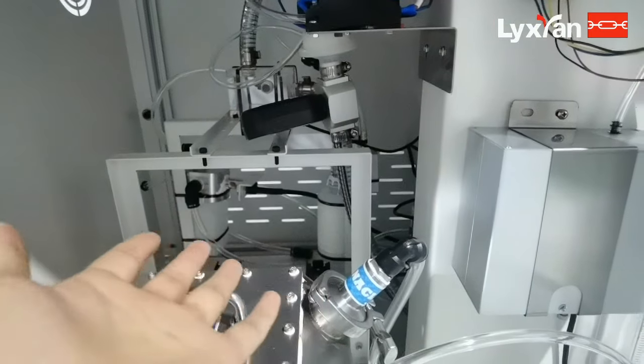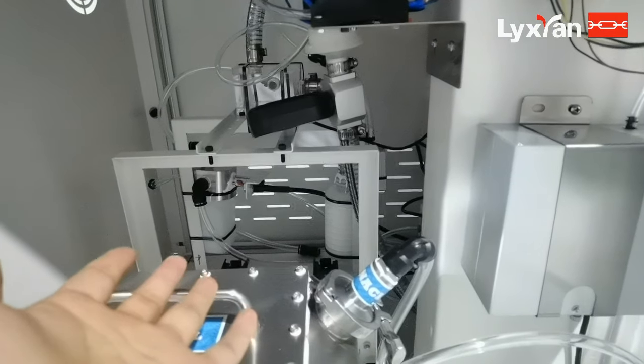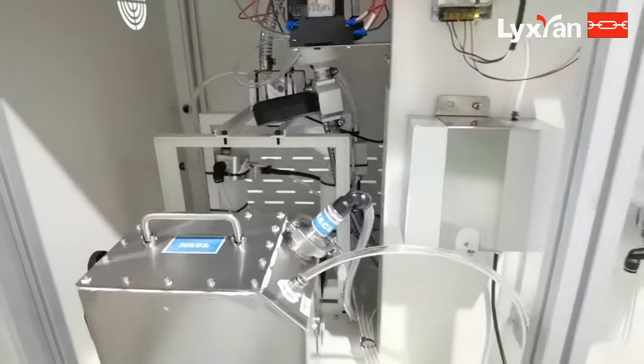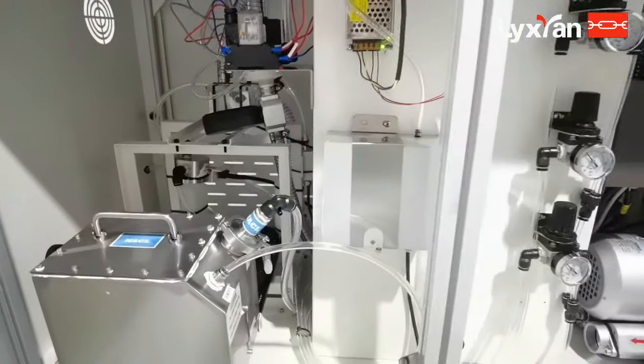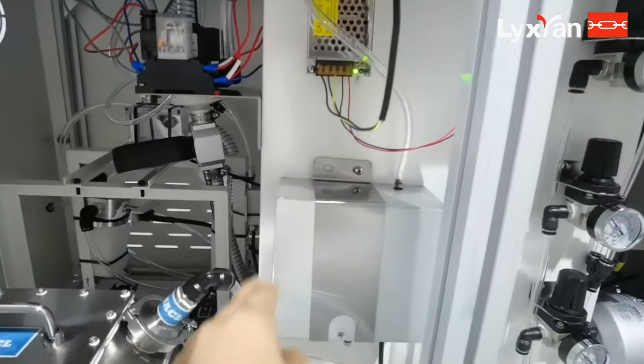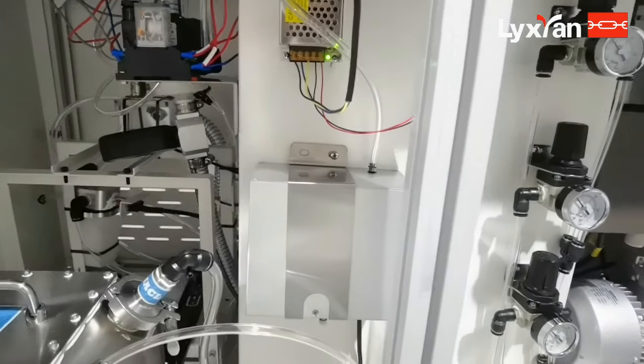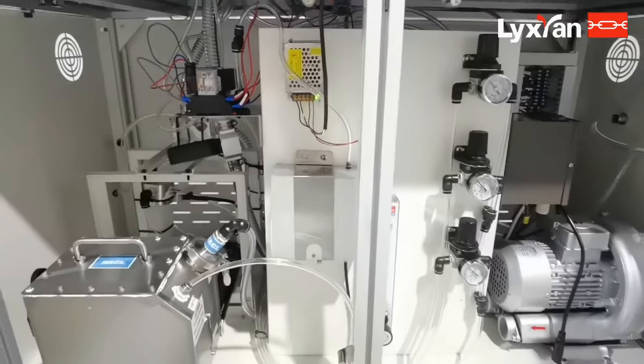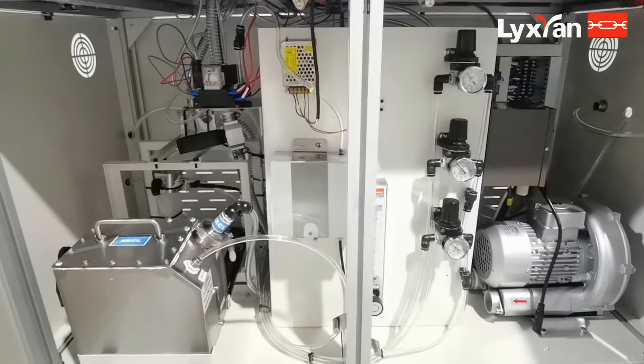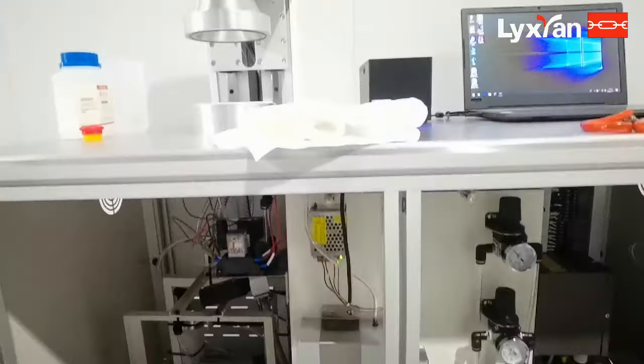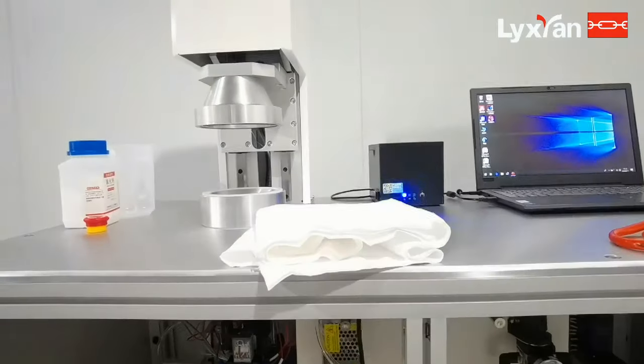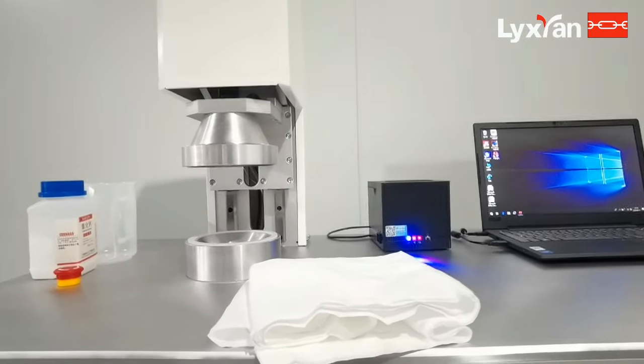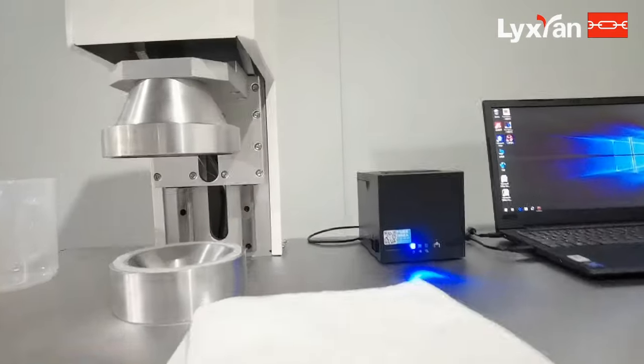This is the structure of the machine. This is a photometer, and now we start to do a simple test.